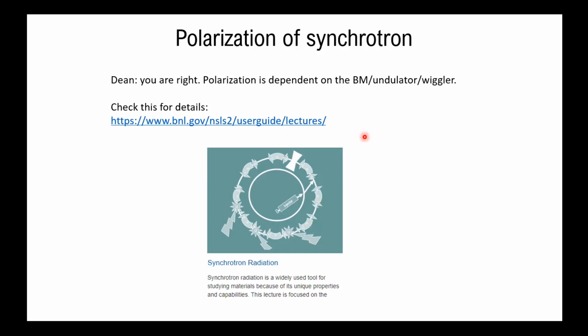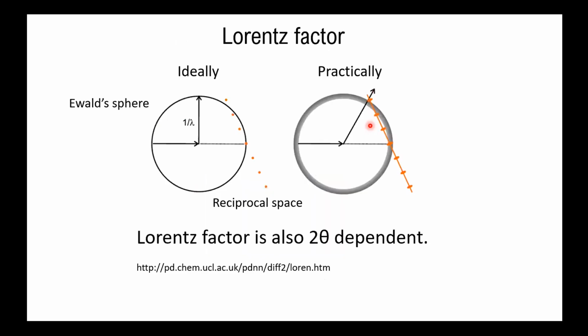I'll show how that translates to some practical application. For example, when we do the real refinement, what kind of parameters we should use based on this kind of knowledge, right? This lecture will give the details, but at this time, we can be satisfied with knowing that synchrotron X-ray gives us a highly polarized X-ray, where the ratio almost equals 1 in all cases. Okay.